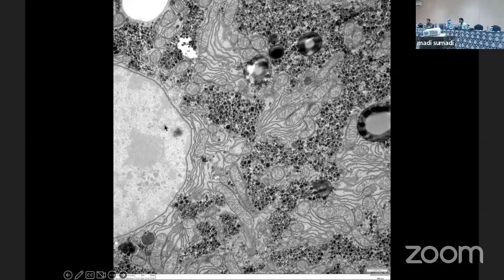Dense? Yes, the dense is required. That is absolutely true. The electron density is higher, that is why you see the structures. Absolutely. But what are these? Why is the electron density higher there? What are these structures? That is true. Good observation. Why is it dark and why is it bright?